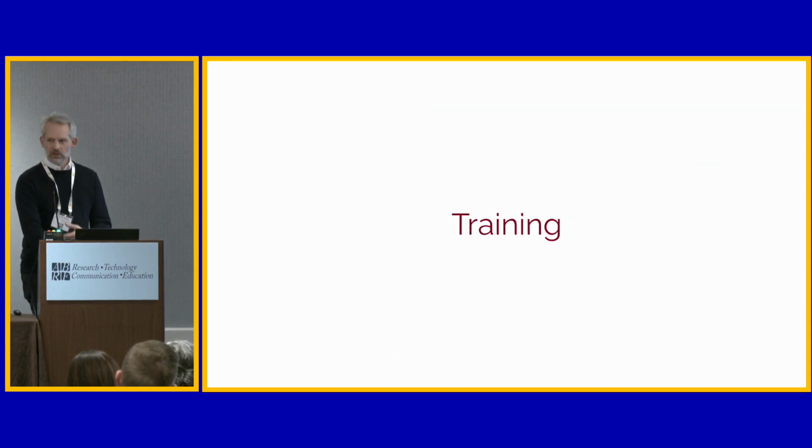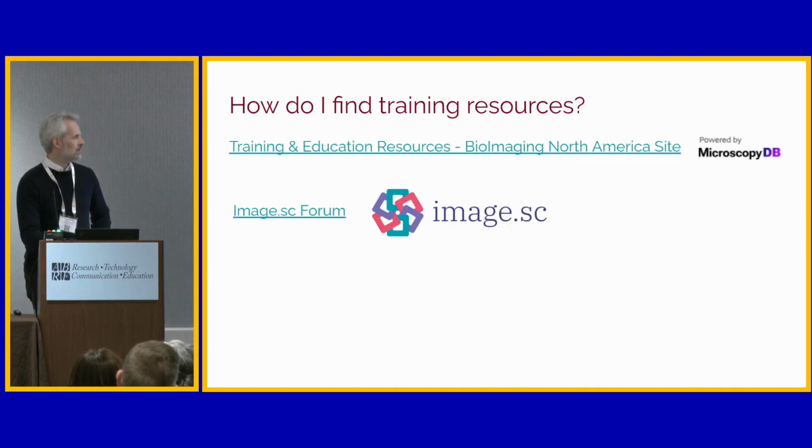Good. Now, in terms of training, a lot of resources have already been exemplified. I just wanted to point to one which collects them all. The Microscopy DB has a whole section on training, so there are a lot of courses and events that you can tap into to learn more about doing AI. And the forum is always a great choice to start, asking a question. If you ask how do I get started, I'm sure you will also get a lot of good answers there.